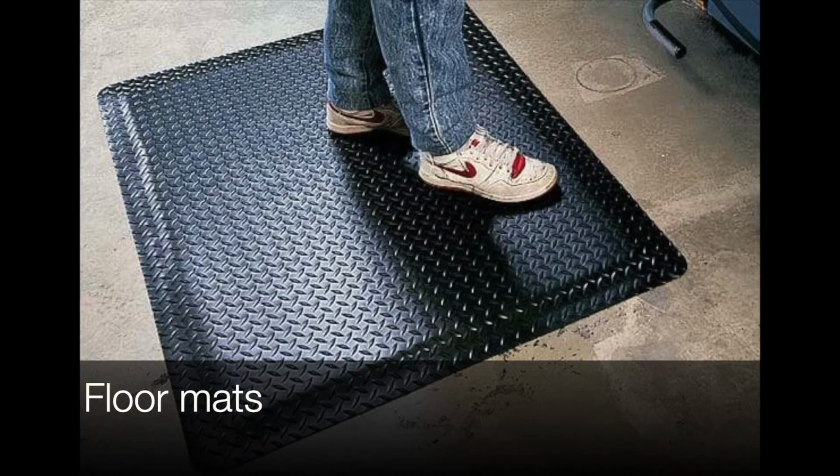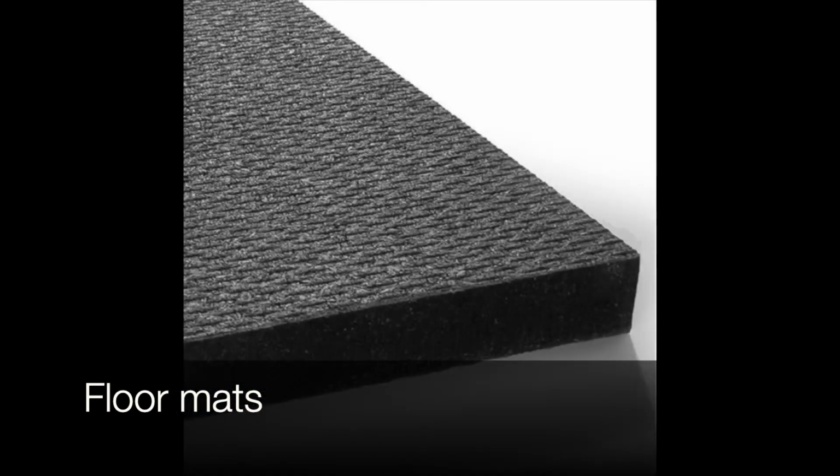Floor mats. Floor mats can be difficult to effectively clean. Listeria can be protected from sanitizer in micro cracks in these mats and can be squeezed out by pressure when people stand on them.